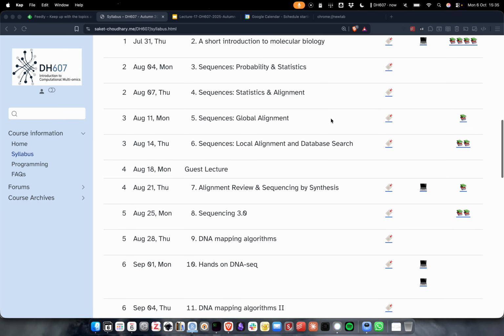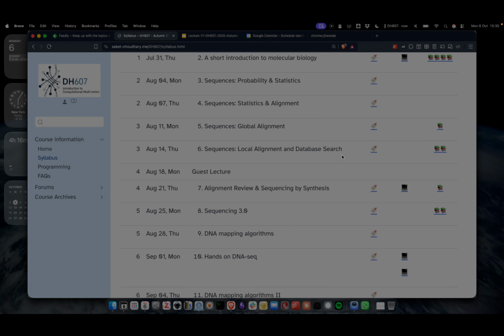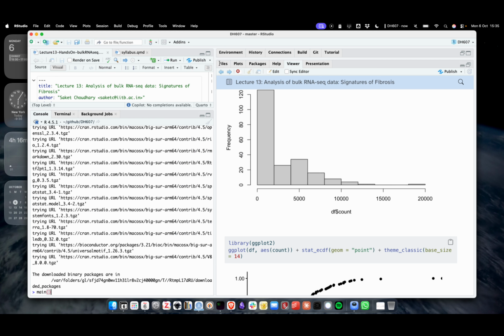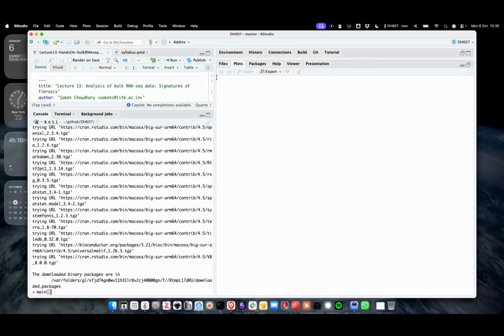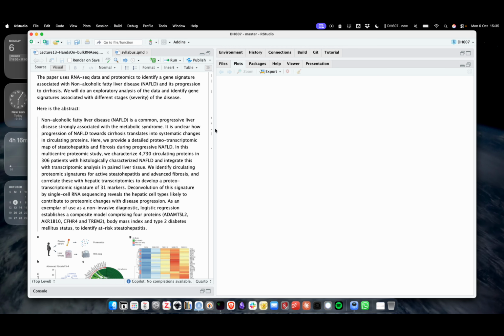For today is to actually finish things we had started almost 3 weeks back now, if not more. Okay, so hopefully all of you will have that hands-on from the previous one. Okay, so this is the same hands-on that we're talking about from a while ago.